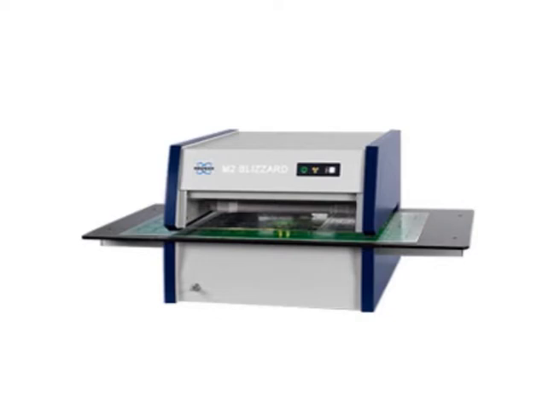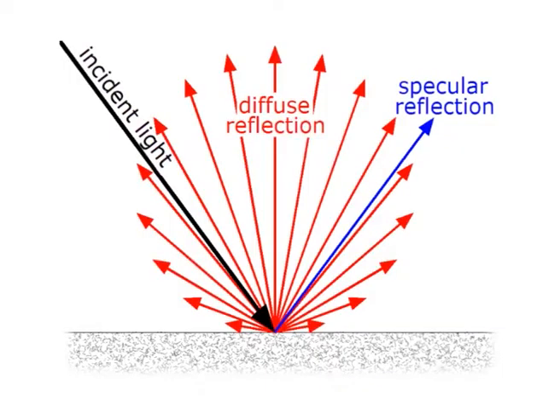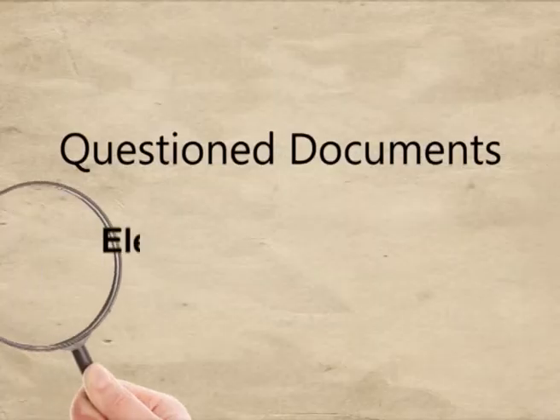VSC provides the facility of microspectrometry. The spectra exhibit the light intensity and wavelength. The range of wavelength is from 400 to 1000 nm. Four types of spectra graphs are produced, that is reflectance, absorption, transmittance and fluorescence. Spectrometry provides valuable evidence in many ways in the forensic examination of documents.